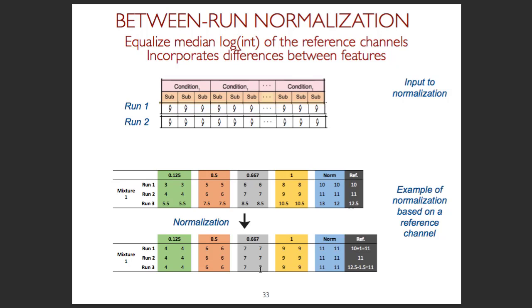Okay, so that's kind of the similar theme as in MSstats in general, where people compare conditions first or channels and do some things to them. Statistically, the correct approach is actually the opposite. First, prepare your data, and then compare conditions. So we get to the ratios or to log-fold changes at the very, very last step of data analysis. If you do the summarization right, and you do the normalization right, then you use the summarized, normalized data to have these generalized ratios, right? Compare the fold changes between conditions. And the reason for this is really kind of philosophical, right?